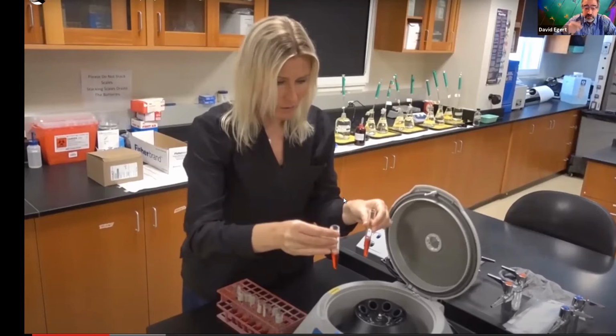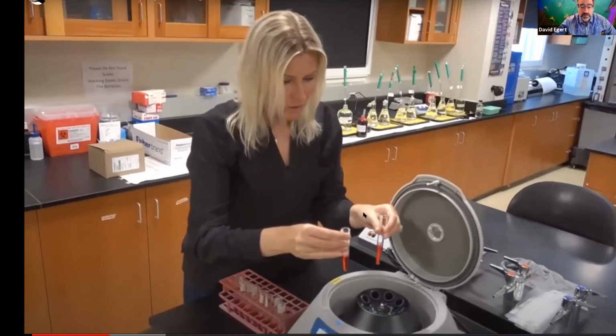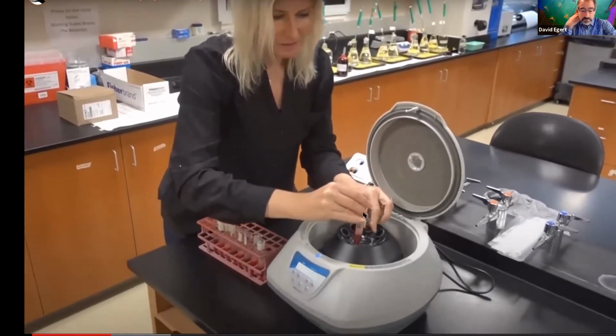So she's checking to make sure that I didn't mess up there and that it's the exact same height, so we're not going to be off balance. And I think in a previous take I mentioned that we're going to have lots of separate tubes with different numbers, so you definitely want to make sure you're labeling things well. I'm going to stick things right across.